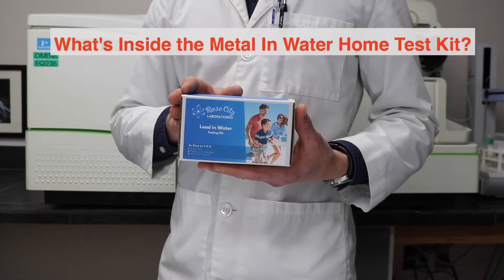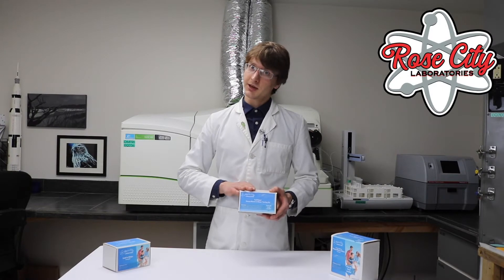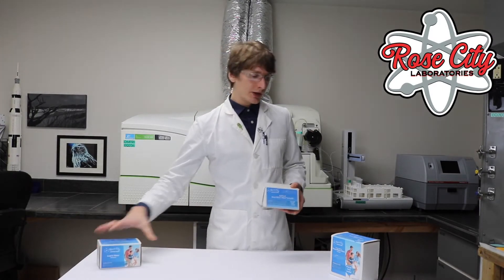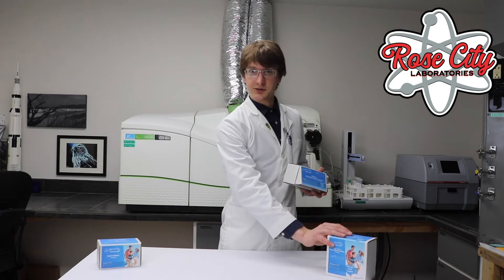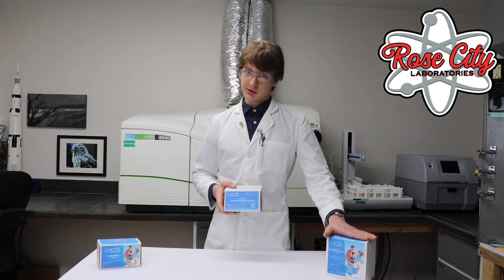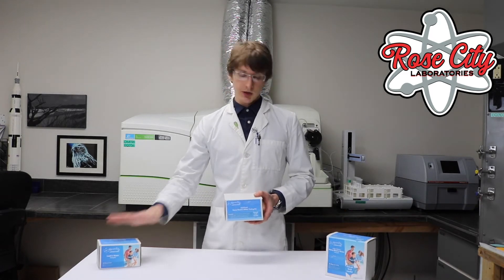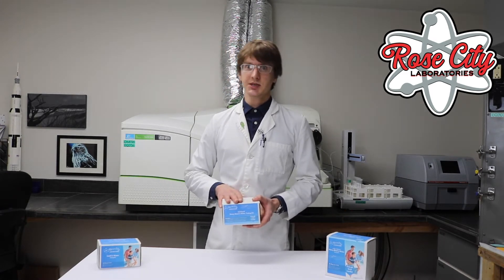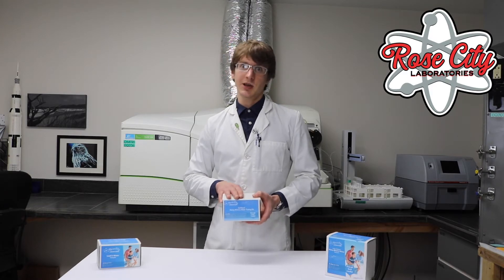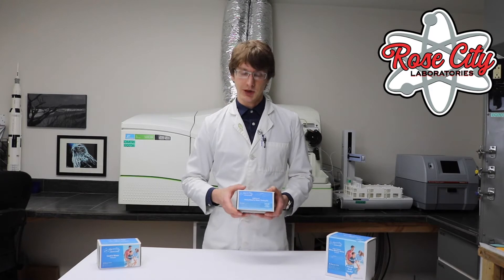So let's talk about what's inside one of these kits. This is the heavy metals full panel kit. We also have the lead testing kit and the two-step full panel testing kit. The difference between these kits is simply that this contains two bottles for collecting samples while these contain one. The difference for us is that we perform different analyses on them at the laboratory, and you'll get a different set of results depending on which kit you pick.